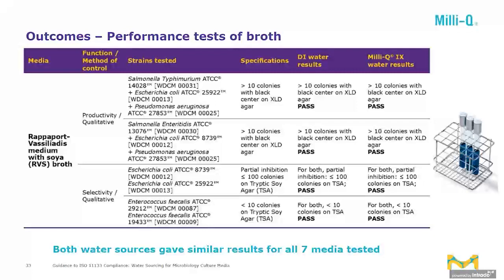Okay. So as a conclusion, the ISO 11133 standard describes the methodology and the specifications for the preparation and testing of culture media. And preparing this culture media with constant and reliable water quality will ensure reproducibility and accuracy.